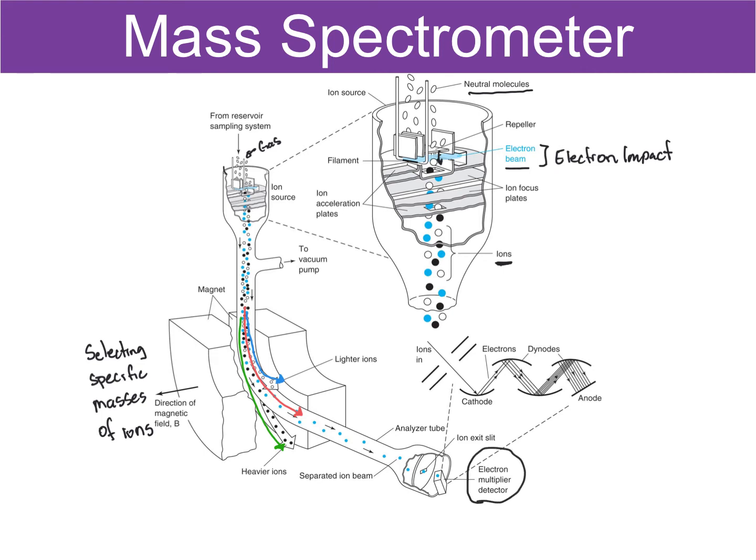And also, like in spectroscopy, the detector is an electron multiplier detector. And so the ions hit the cathode, causing electrons to eject. And just like the PMT, the photomultiplier tube, we are going to amplify each ion into multiple electrons, thus multiplying the signal that we get.